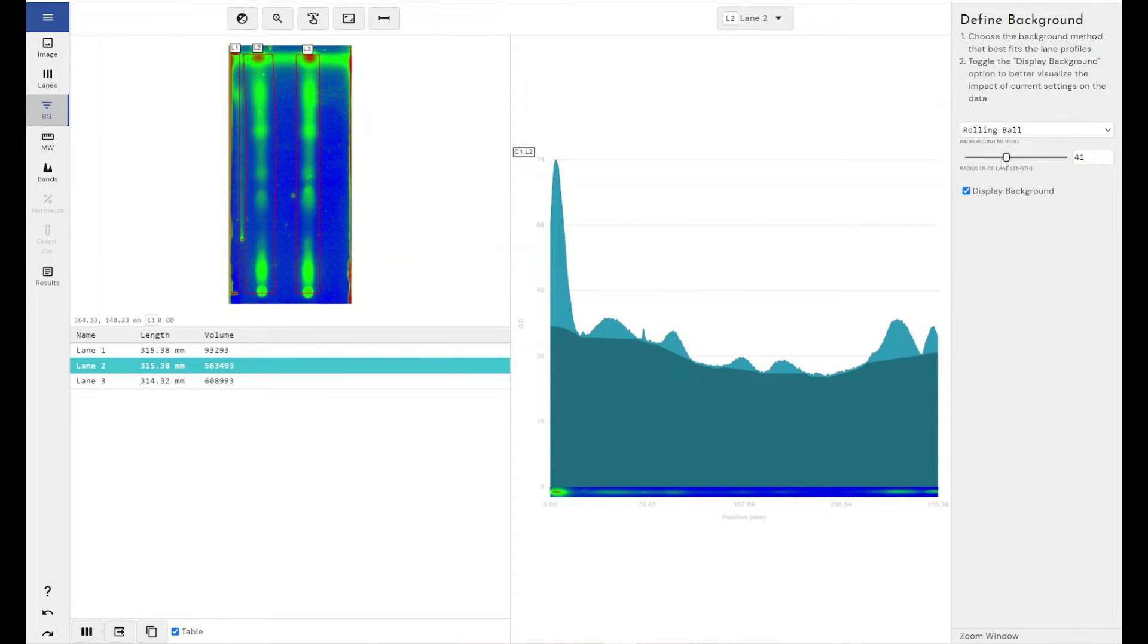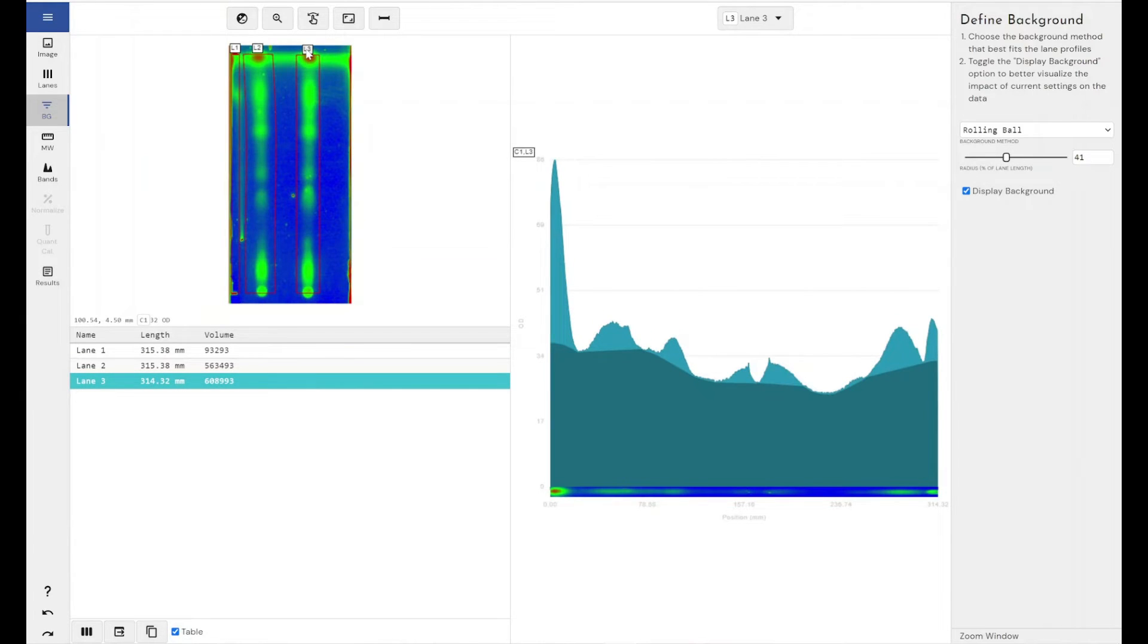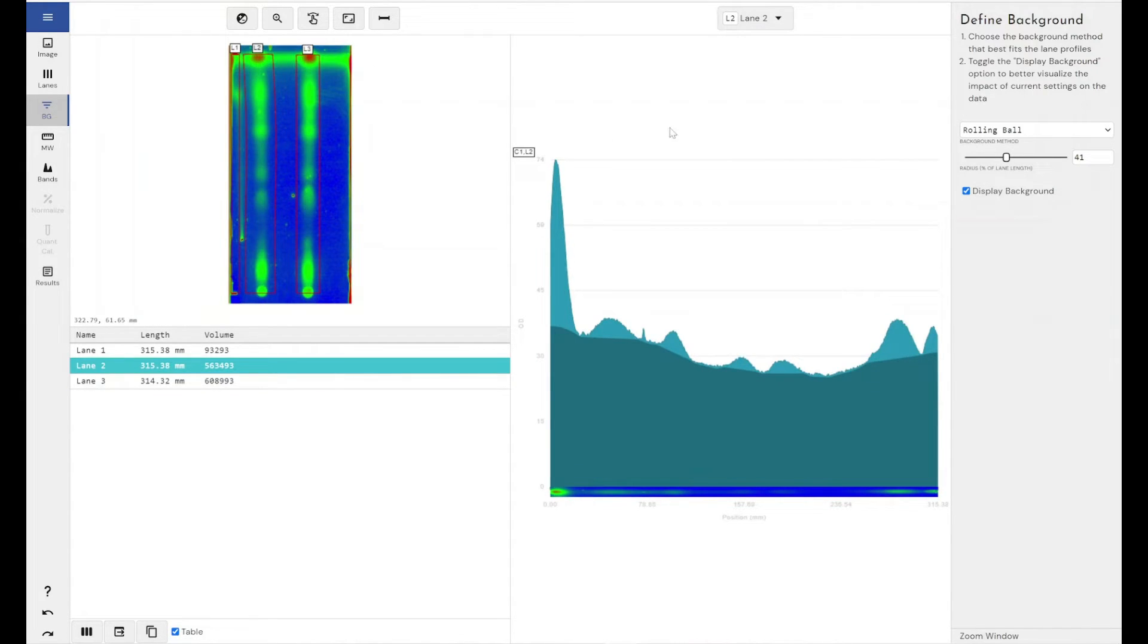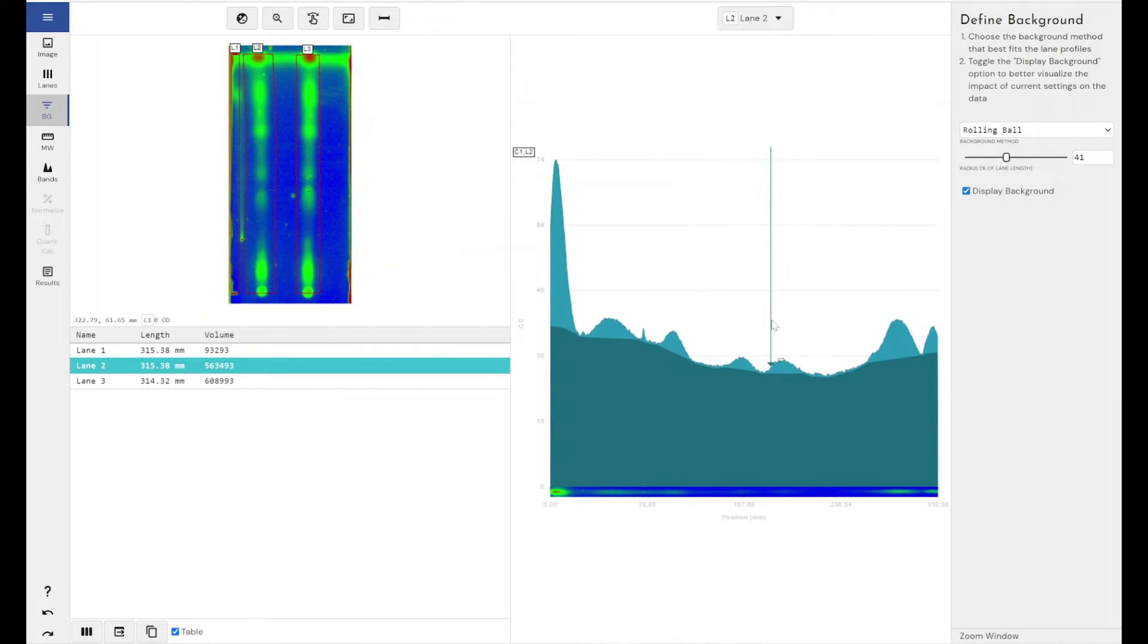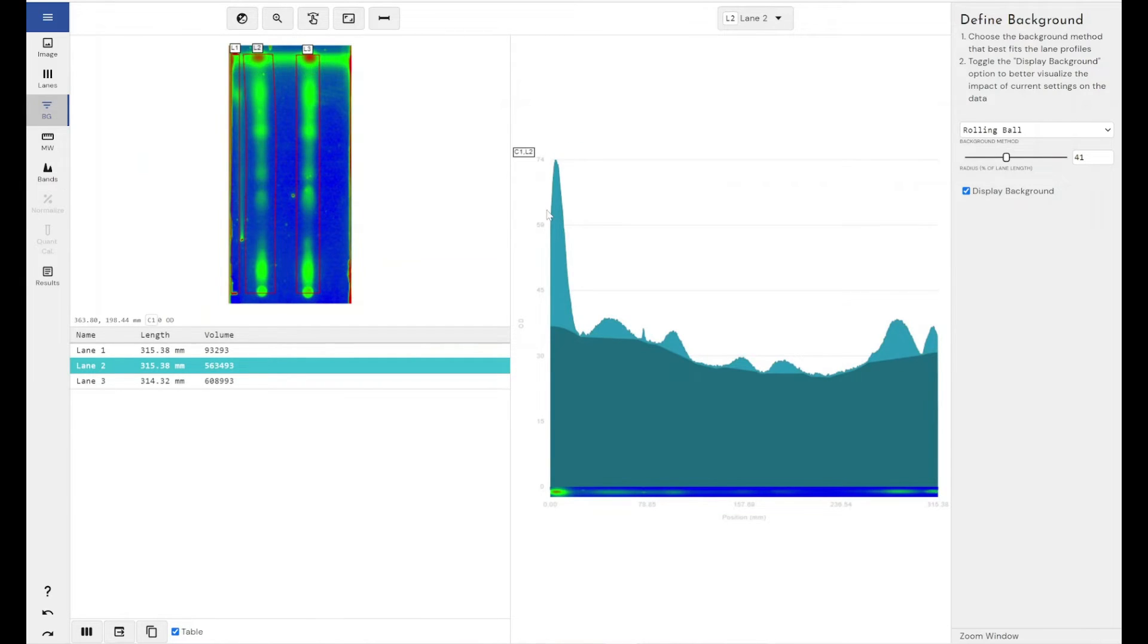So that's why we would always recommend using rolling ball. However, in some experiments, there's very little difference between rolling ball and some of the other methods. It's just that in most experiments, rolling ball is generally the best one to use. So if I just have a look through my lanes, I'm happy with that. Again, a TLC experiment is less about quantifying bands and defining bands and more about working out how far fractions have moved in relation to each other and things like that. However, we do have the tools to do quantification and volume measurement within Phoretix.